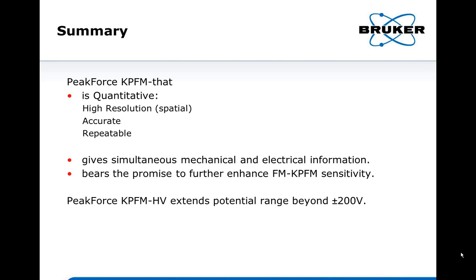And I think you answered also, there was another question on the probe. Yes, the probe is part of the package, and it also contributes to the consistency. Yes, exactly. The probe is actually one big part of the consistency.